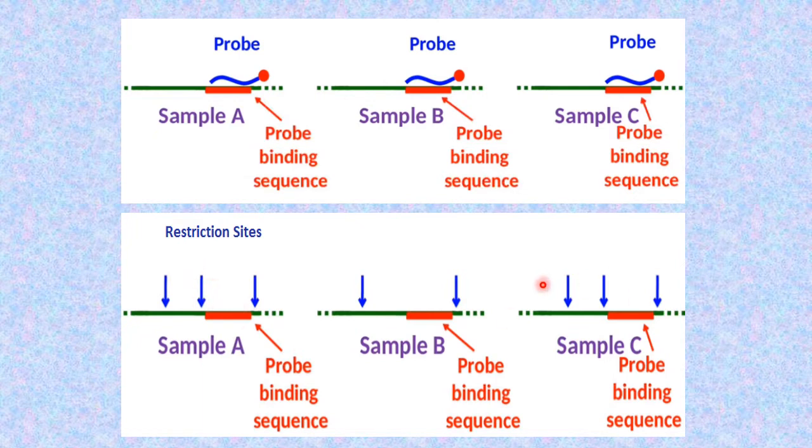this recognition sequence, which is present at this point in samples A and C, is not there. That means sample B has just two recognition sequences at which the phosphodiester bond may be broken up by the given restriction endonuclease enzyme.